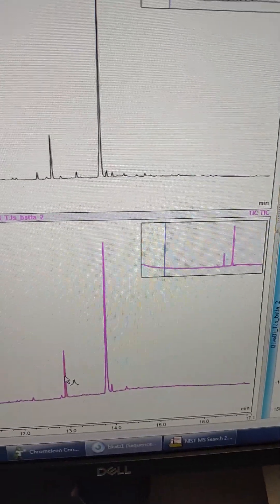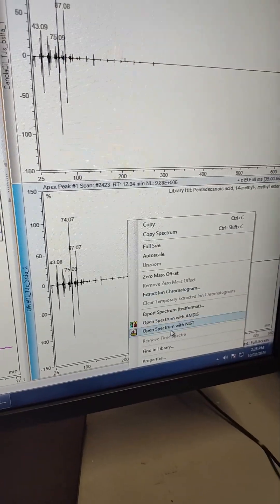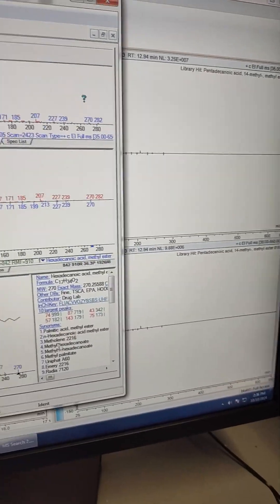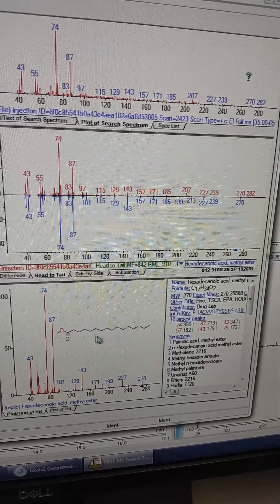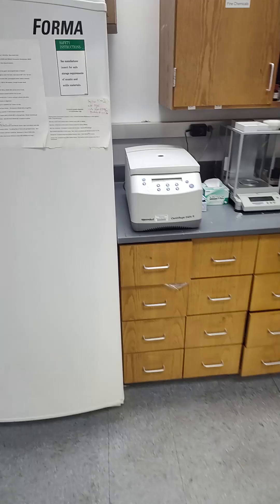So then this other one really early here that is in both of them as well. Another reason why I don't really trust this GCMS data. And that's palmitic acid. Again with the methyl ester. This is fully saturated palmitic acid. No double bonds.